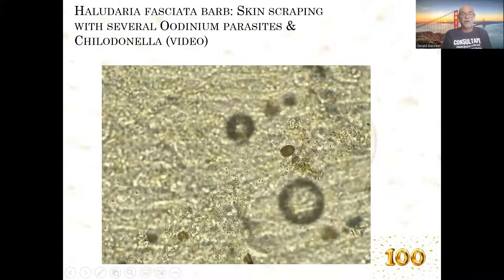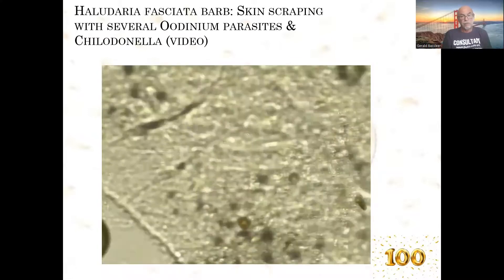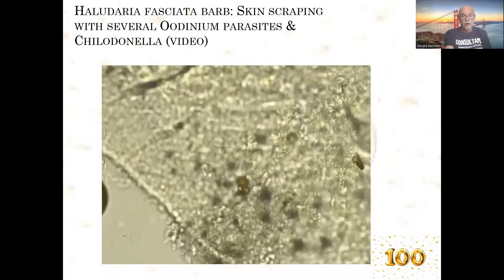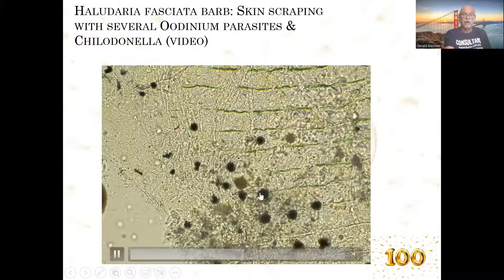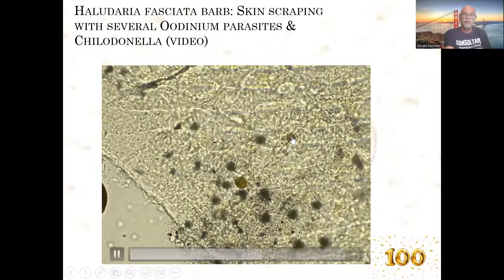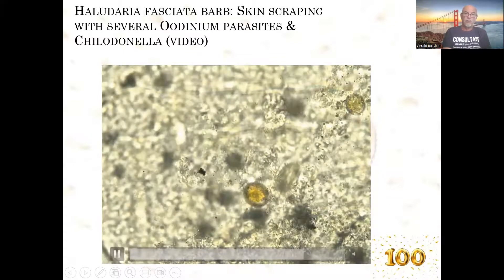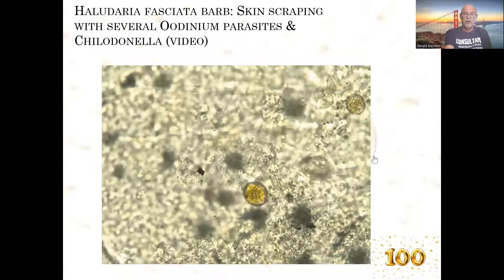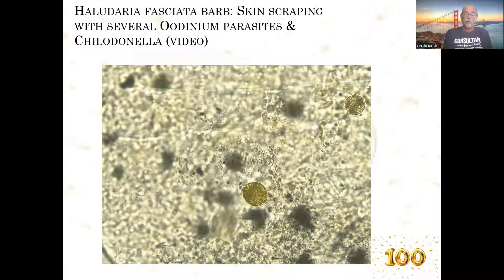Also during observation we see those dark brown parasites. Some are looking like pigments — the black spots here are pigments — but the brown ones, as shown at higher magnification, are oodinium or velvet disease. At the same time you see the chilodonella parasites moving around, while oodinium is not moving; it's penetrating and hooked inside the scale, causing local damage and the risk of bacterial infections.